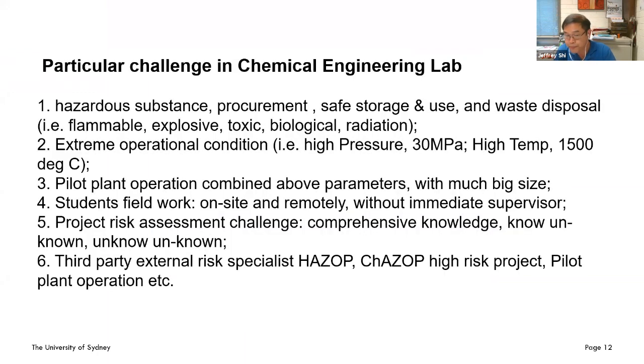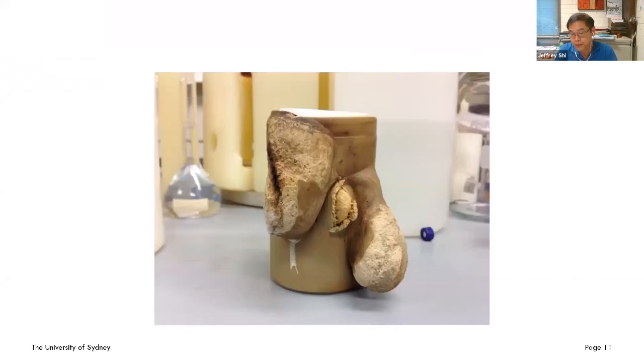And what happened? The water used, the orange peel used, the pressure design limit, the temperature, all on a good course would be okay. But there is a limit. For example, that vessel is 100 milliliters. The recommended amount of water or sample you use is not over 20%. For example, 20 milliliters in a 100 milliliter vessel. It's perfectly safe. At 150 degrees, the pressure will be well within the limit of 100 bar.